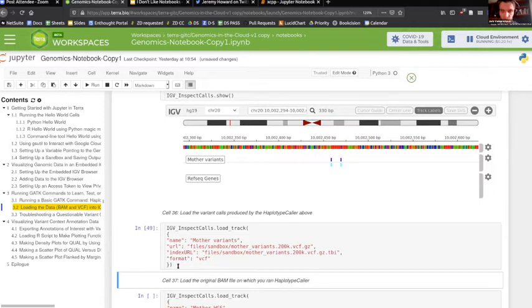And one thing that I want to point out is you have this curious prefix "files" here, and the book also points that out. I didn't really understand what that was about, but IGV has somewhat of a quirk in the sense that if you want to look at files that are locally on your drive, you have to put "files" in front of the path.